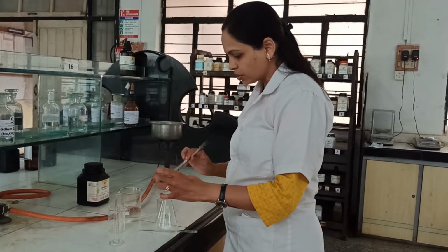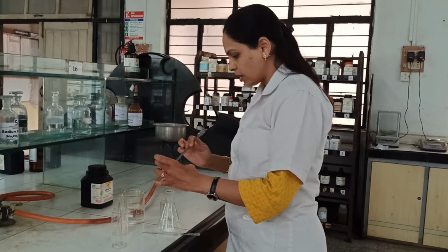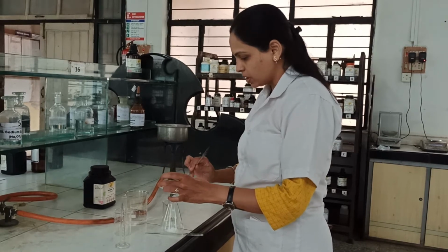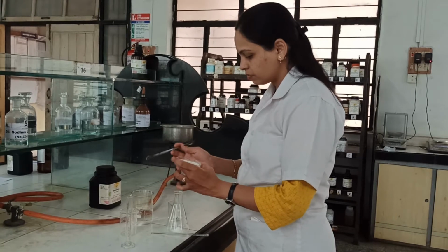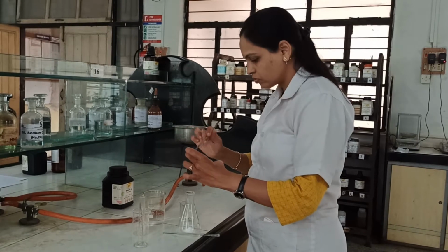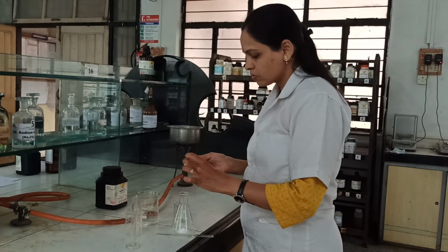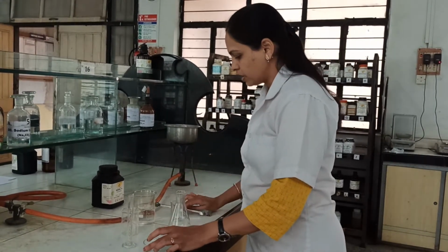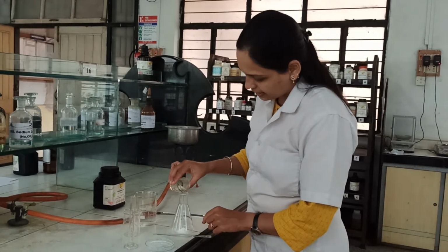Already we have seen the procedure. Now we will perform the synthesis. So I have previously weighed 2.5 gram of benzoin. After that, we have to add 12.5 ml of concentrated nitric acid.